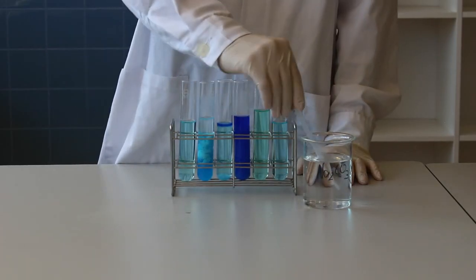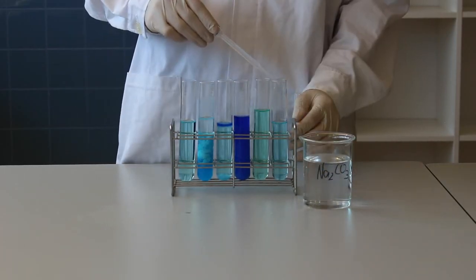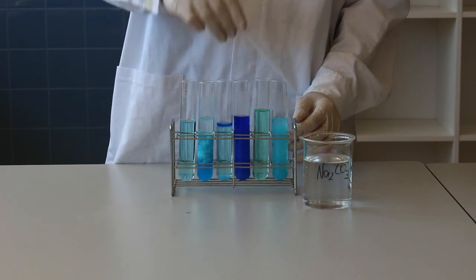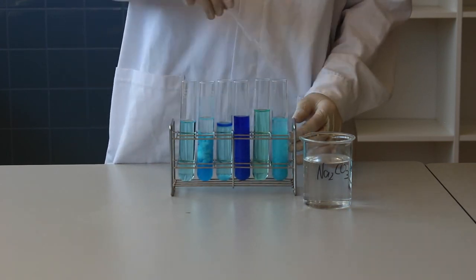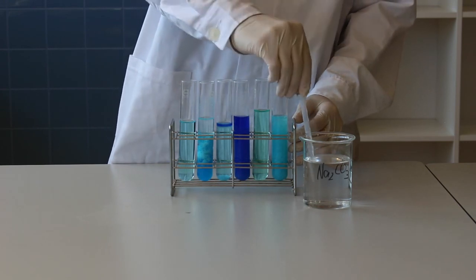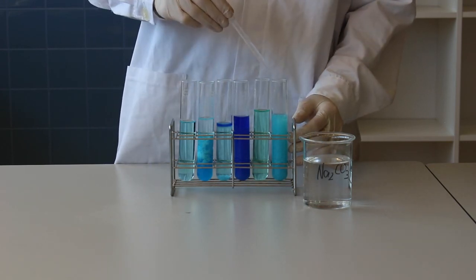And now we add sodium carbonate. Carbonate ions will simply give you a precipitate that you can think of as copper carbonate. The carbonate ions will create a light blue precipitate.